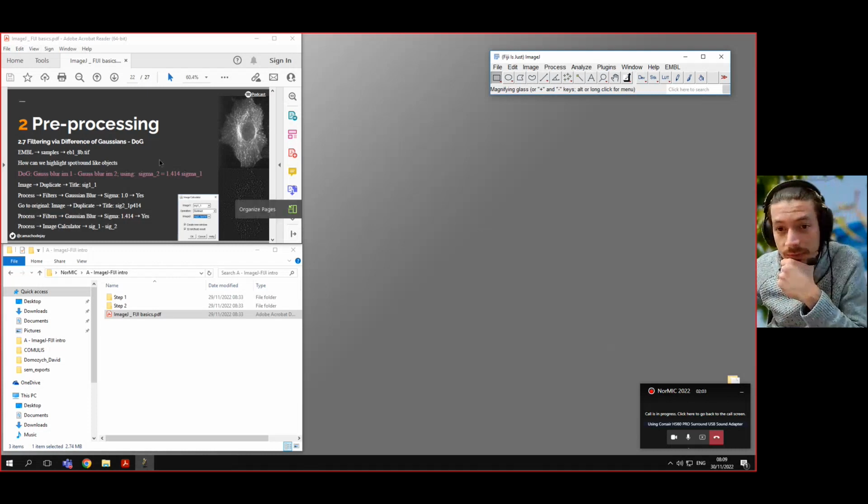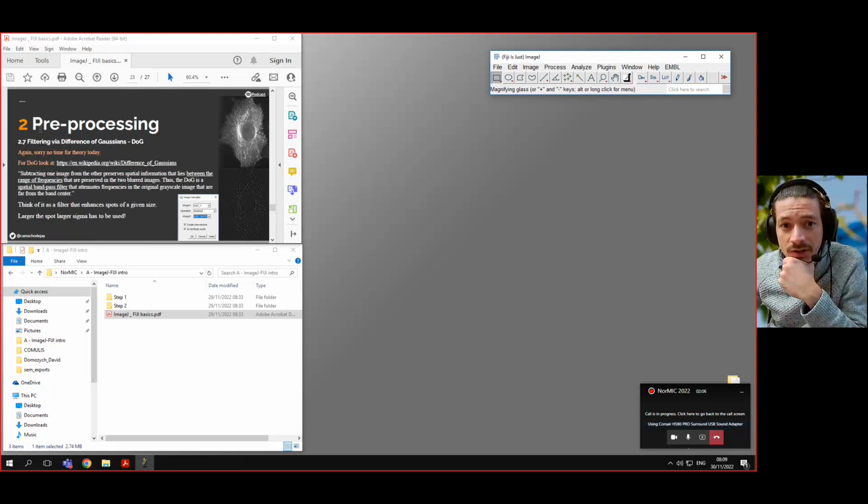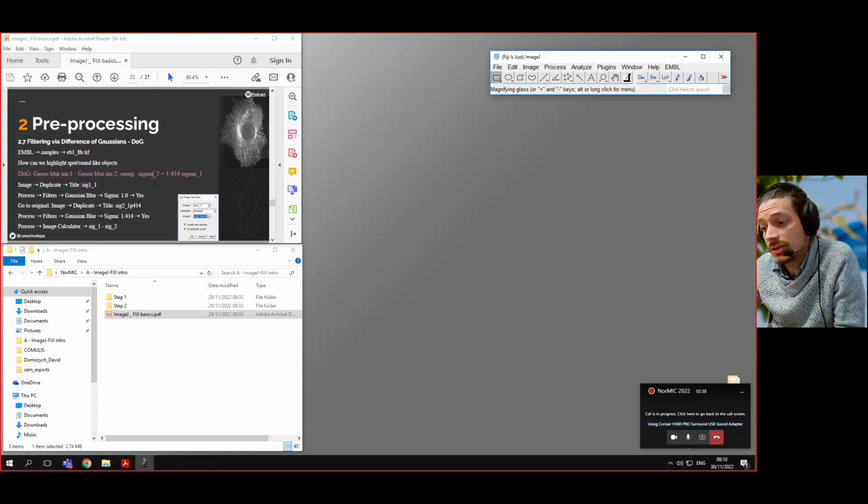I do not have a lot of time to cover the theory. That's not the purpose of the video. So I'm just gonna direct you to the information that is in the PDF, which you can find in the links for the material of the course. If you go into the definition of difference of Gaussians, you will see that this is sort of equivalent to doing a bandpass filtering in the Fourier space. So it's particularly powerful for spot detection because round small objects of a particular size will be enhanced and all other objects will be decreased. And the size that we will enhance will depend on the parameters that we use for the differences of Gaussians.